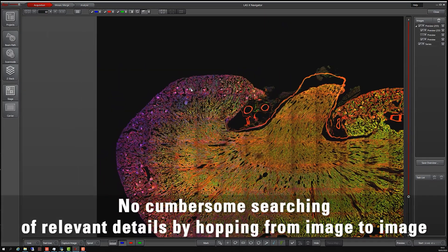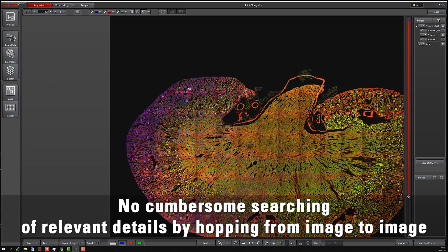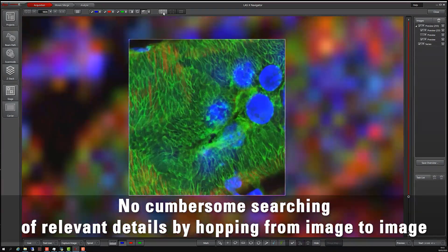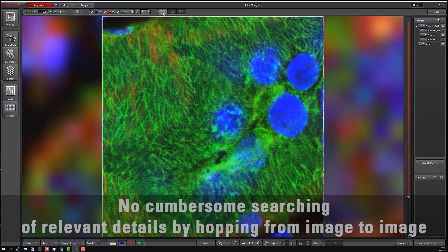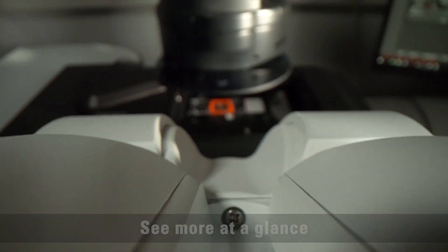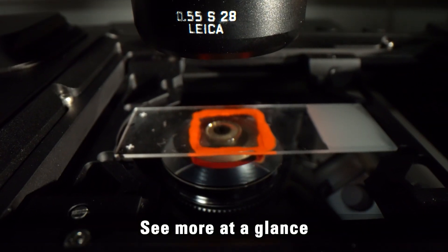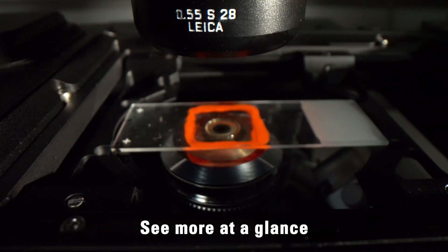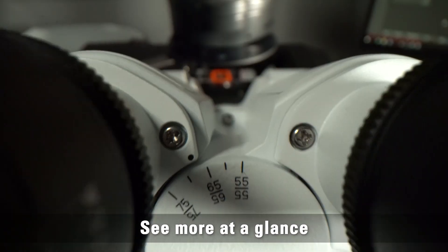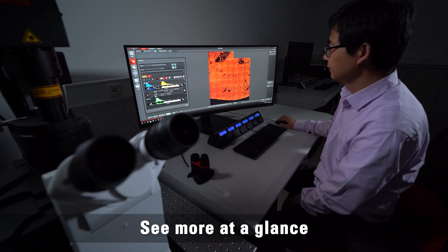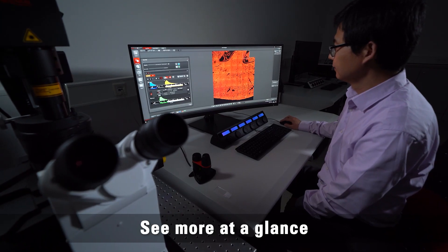Navigate intuitively and seamlessly from overview to high resolution detail. LASX Navigator can increase your viewing area up to 10,000 times so that you can scan your slide in one go.